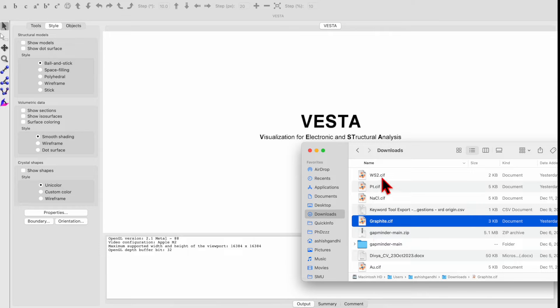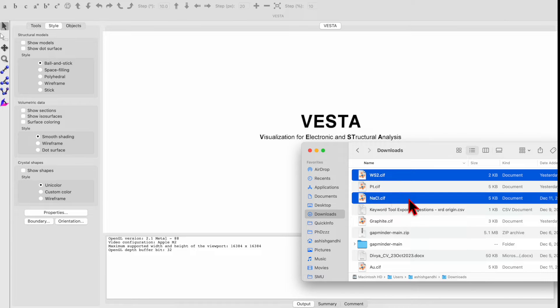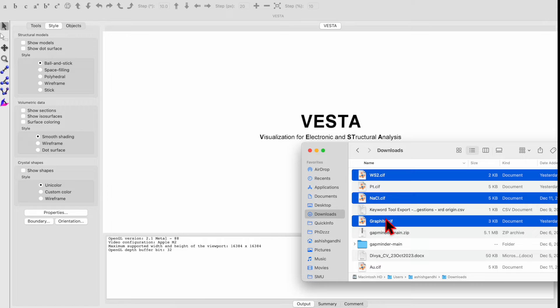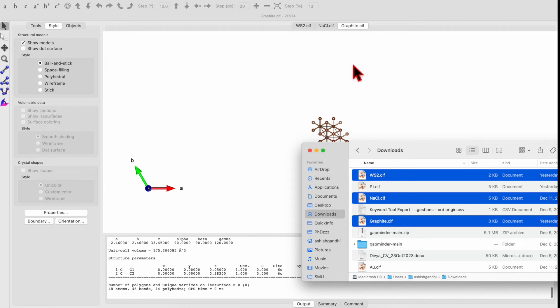So let's go to the Vista software. In this folder, I have CIF files downloaded from COD website. We will be considering examples of WS2, sodium chloride, and graphite. Select these files and drag them to the Vista software.